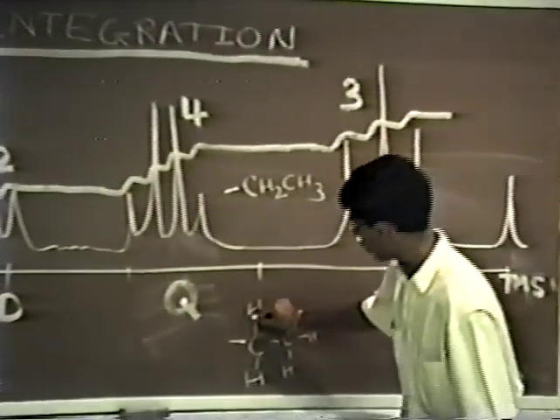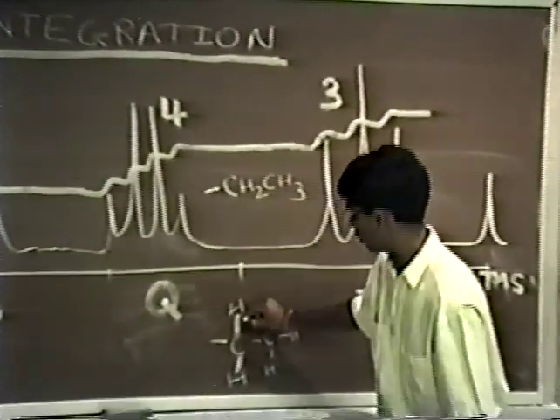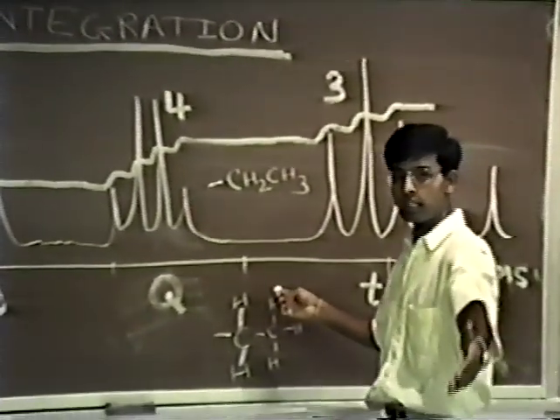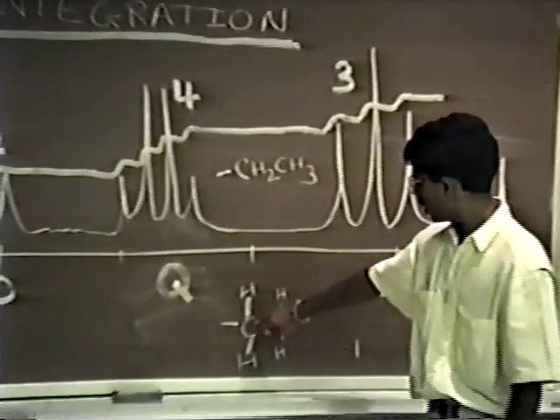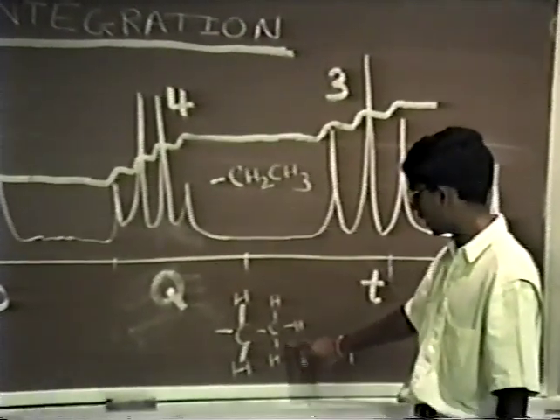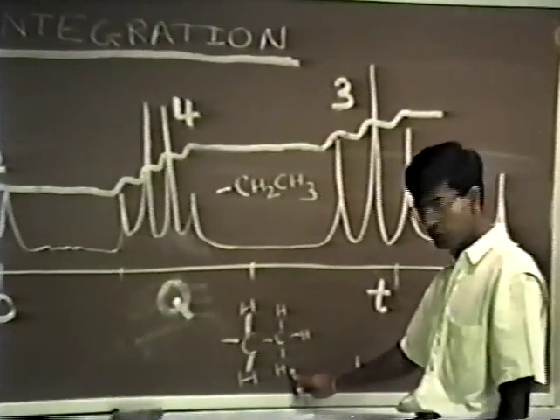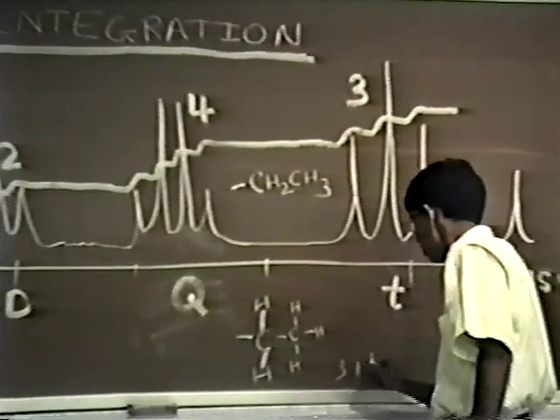For example, if you're looking at these hydrogens here, 1, 2, as Paul mentioned earlier, the N+1 rule, both of those represent 1. On the adjacent carbon, if you count the number of hydrogens, you will have 1, 2, 3 hydrogens. That will be your N. That's 3 plus 1.